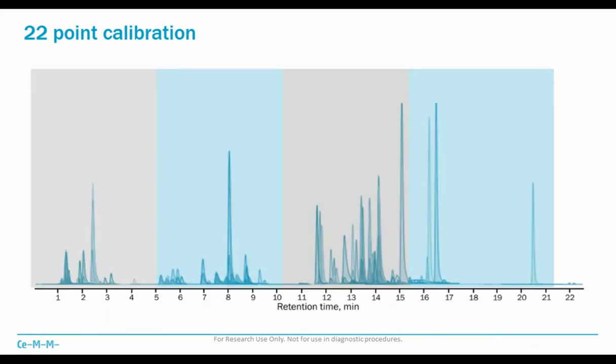But again, the practical limit remains, right? You cannot just mix them all together, as I mentioned before. So what we did, we took all those metabolites and divided them into 4 groups. And we divided them based on their retention time.